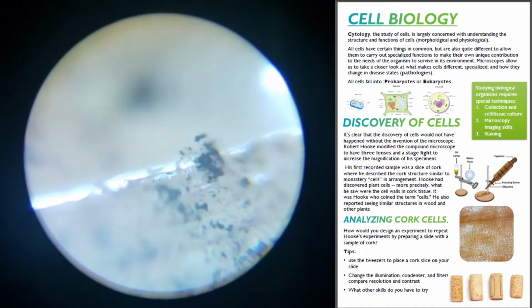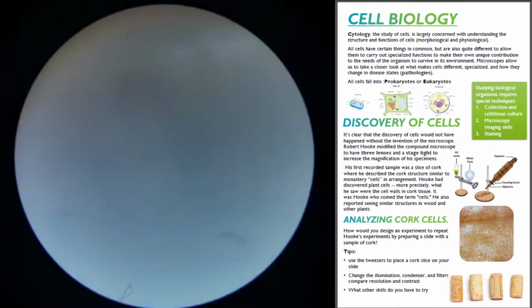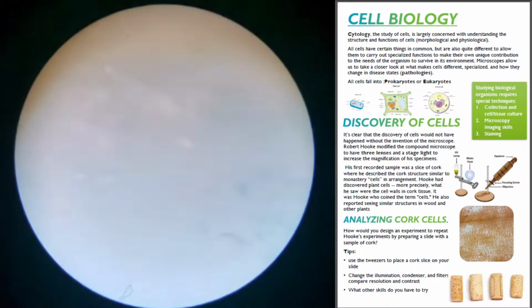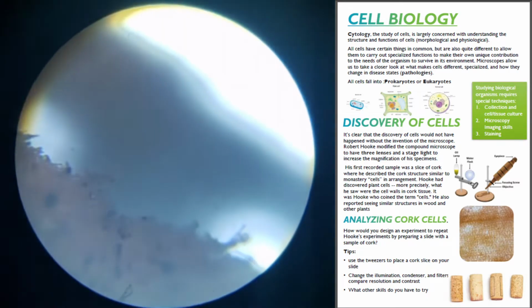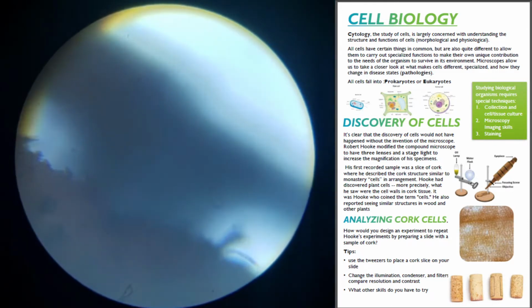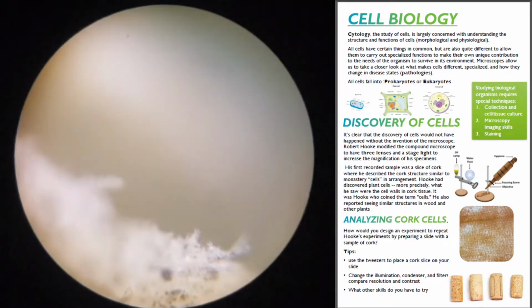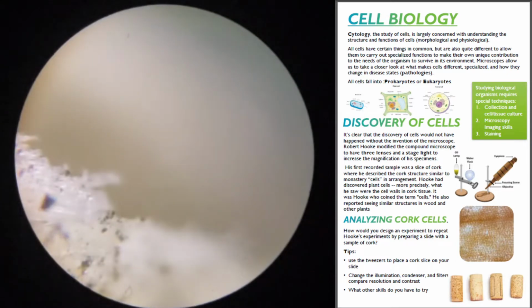No, not really. So what do you think? Do you think this was a real piece of wood, or do you think that it was compressed from something? I mean, based on what I was just saying, I would guess compressed, but we did see some stringy fibers. Yeah, it looks pretty shredded and torn, really, right? It doesn't look very like cells.